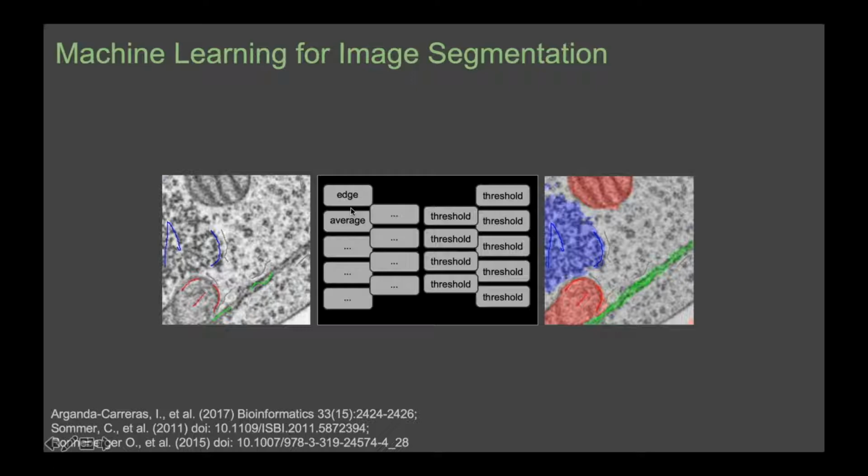And in terms of terminology, the traditional approaches here have been that you just do one set of filters and then you compute thresholds on them. Now the more powerful approach that came around in recent years is called deep convolution, and here the difference is that you compute filters, but then on the filters you compute filters again. So you compute filters of filters, and you also usually downsample your image while you do that to get more context information, and that turned out to be a much more powerful concept. And these deep convolutional neural networks are at the moment state of the art for image segmentation.